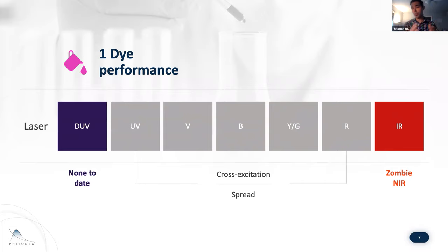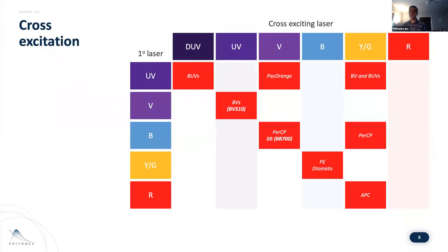And also comment too around, well, what does that mean in terms of thinking around signatures versus just clean fluorescence? But again, we'll focus today on this BYG space. And the reason that we've focused there really is because of some of these foundational dyes that are excited off of these lasers, be they particularly the phycoerythrin conjugates or PerCP, and thinking around PerCP is bleeding into YG, but really thinking around the amount of spread that has been contributed by these dyes that are excited in these lasers and the fact that you really can't use these lasers together on most instrumentation.